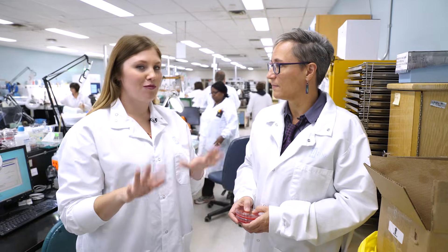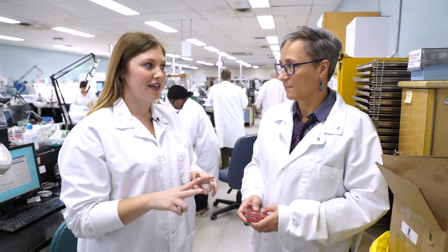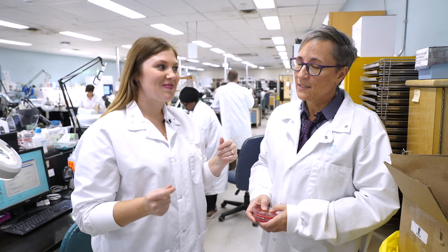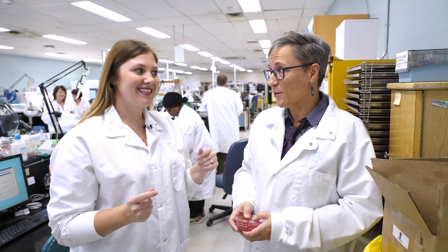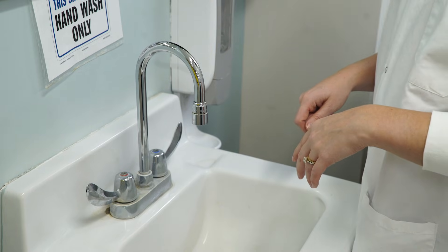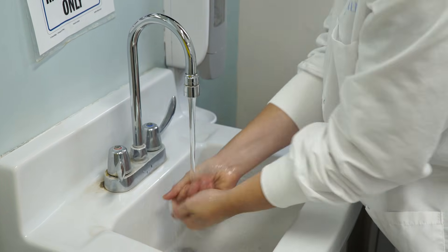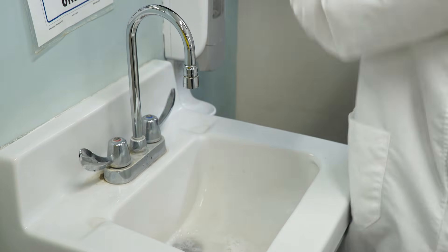Now we have our plate with unwashed hands, and now we're going to wash our hands two ways. To properly wash your hands you need to wash them for at least 20 seconds. People often don't spend enough time, they don't take off their jewelry, and they don't dry their hands properly — which is an important component in getting the hands clean.